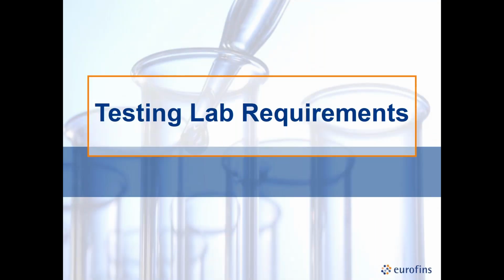In terms of testing lab requirements, I'm going to try to move through this pretty quickly, but just some general things. A lot of times companies will have a large central laboratory. I worked for Dow Chemical, I worked for Mitsui Labs. We had a large central lab. We could take samples to them, anything we couldn't do in our in-house production labs. Our central lab could do it for us, and they were great. But many companies have been phasing those out. And so over the next 5 years, you may have to find a local lab partner, which could be a university, could be a regional lab, or could be somebody that specializes.